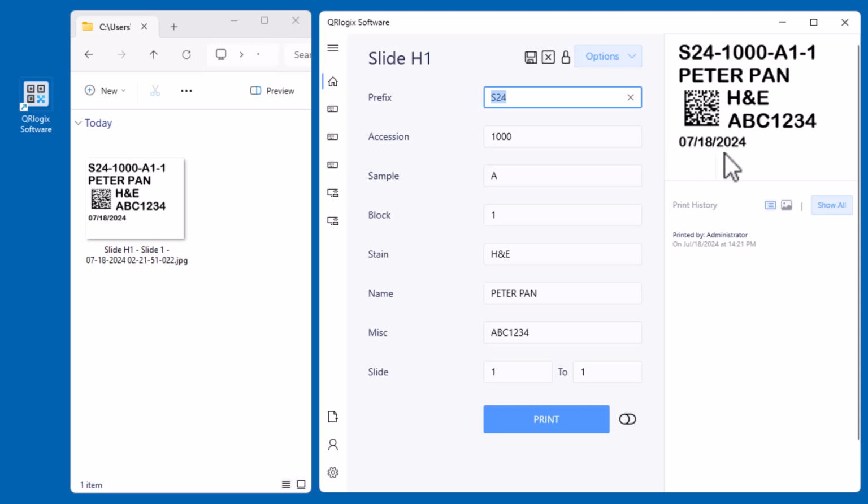If you want to put the date that it was processed, that's encouraged, but not by any means required. And then of course a barcode, that's an option too, but certainly potentially beneficial for storage, archiving, access later on, and potentially identification in the event something happened and we lost the patient name or accession number. But anyways, that's histology best practices.